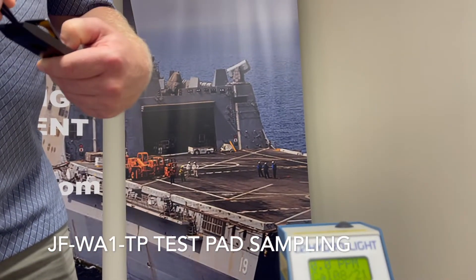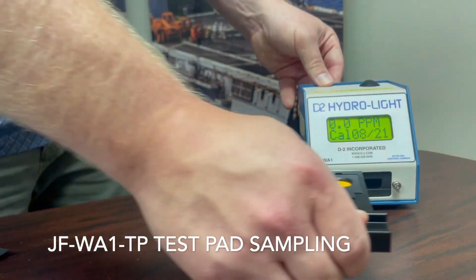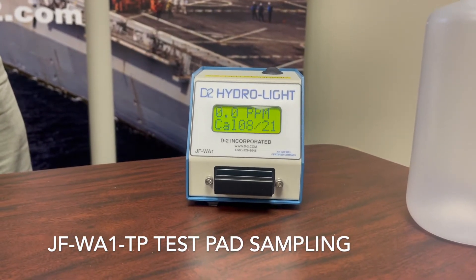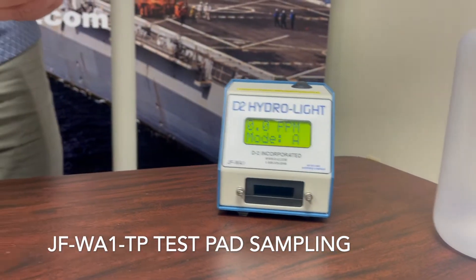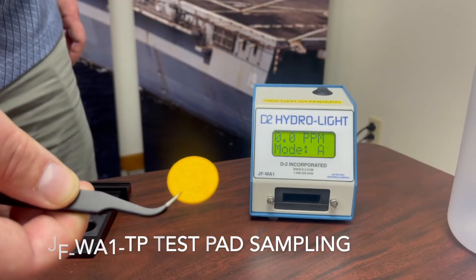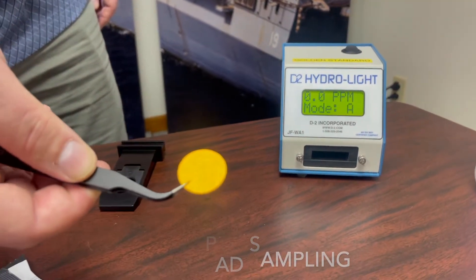Before we run the test — just for demonstration purposes, this you wouldn't normally do — we're going to take the pad and put it in our test shuttle, as you would do when running a test, and insert that into the instrument. Take a look at the pad surface. It should be an even orange color that's unfaded, and there should be no creases, wrinkles, or tears. The pad should be relatively perfect as far as the appearance of the surface goes.